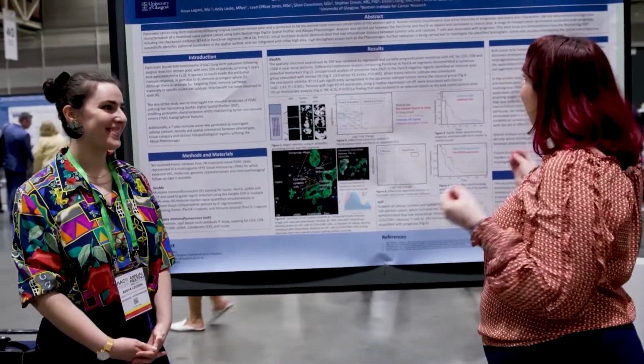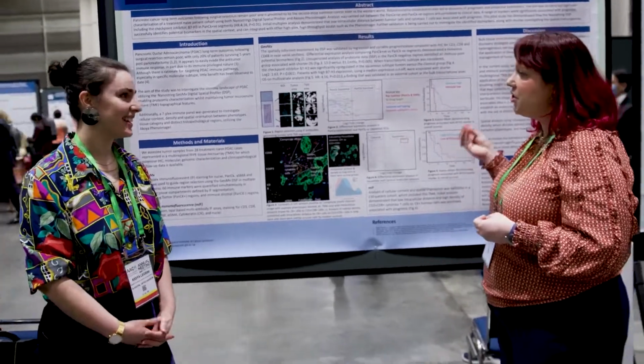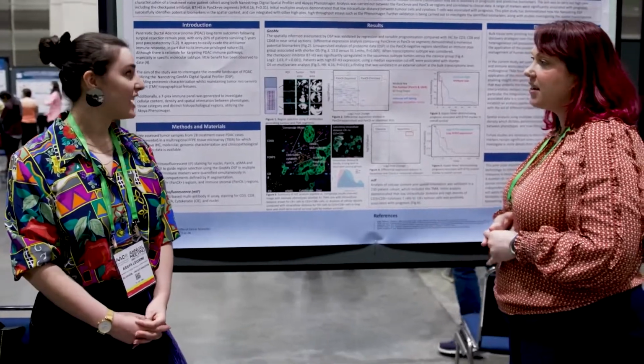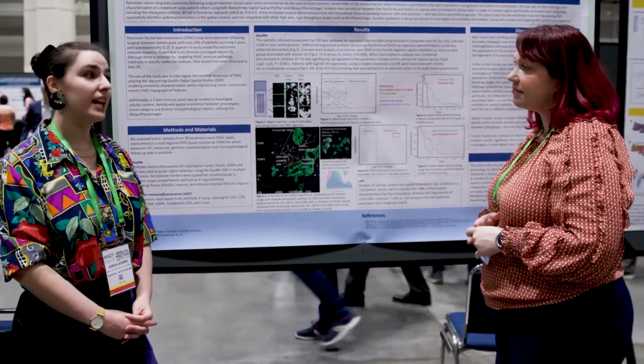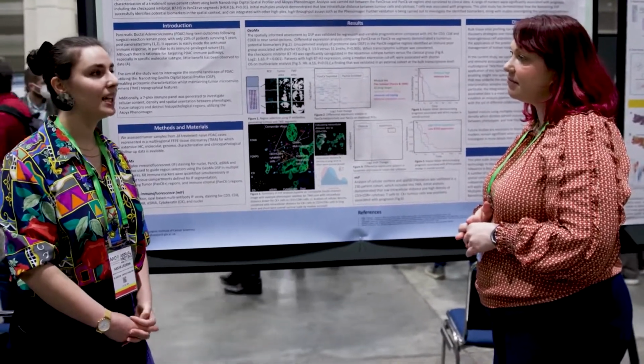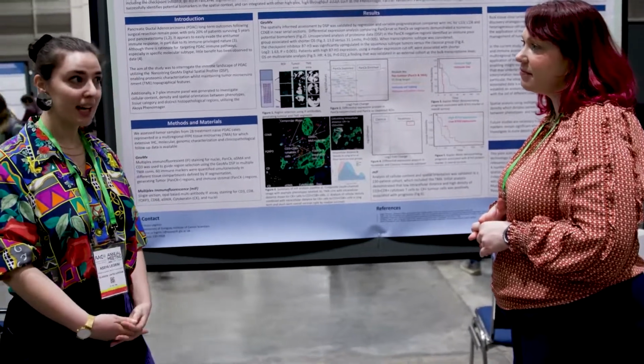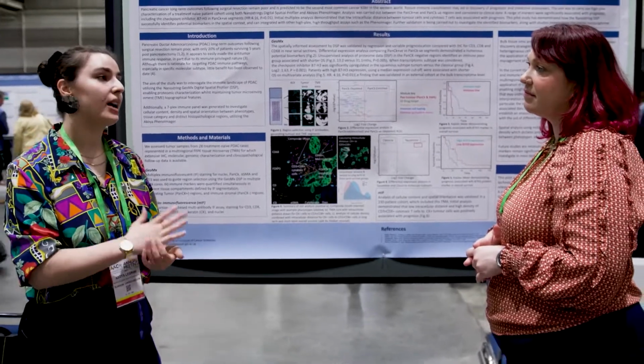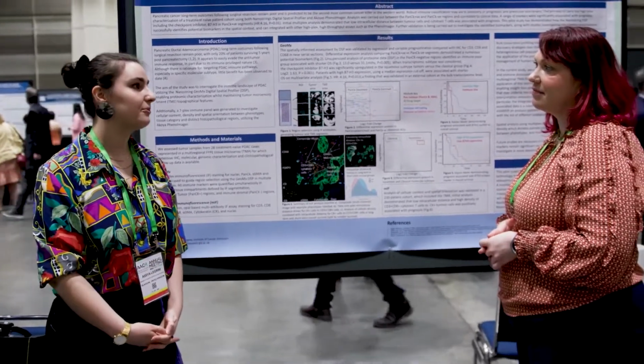Excellent. So do you have any follow-up experiments that you're going to do with the GeoMx? It sounds like you have been using it for other projects. Yeah, so we do a lot of the RNA panel work actually at the moment. So we've just done a whole transcriptome atlas, and we're doing that between treatment naive and neoadjuvantly treated patients.